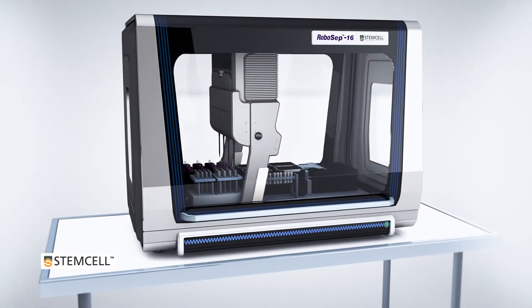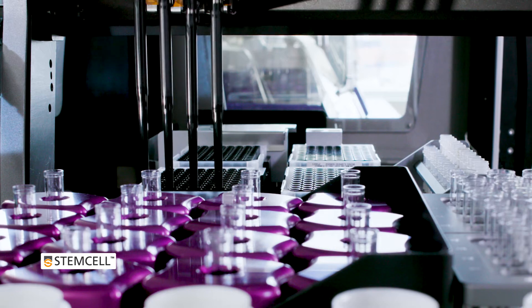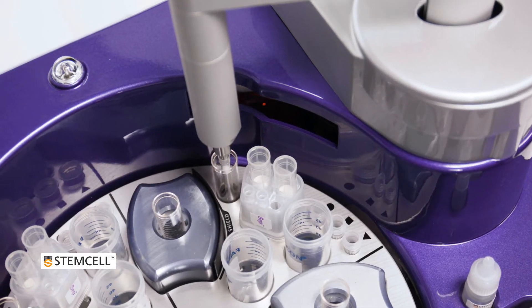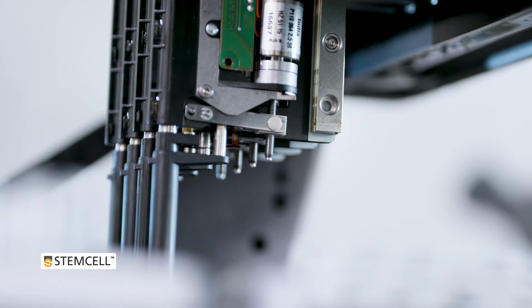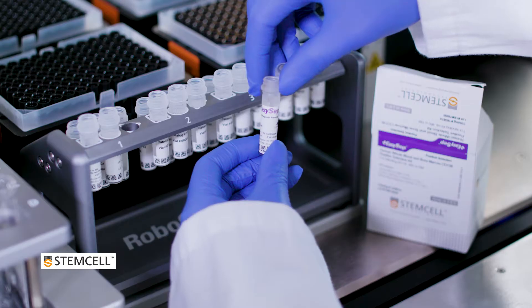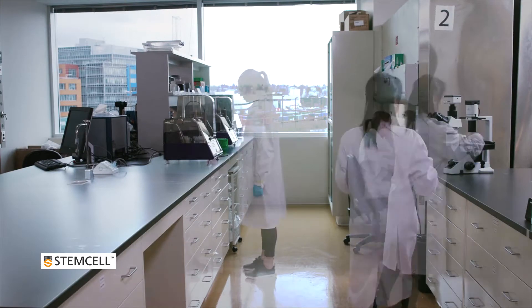RoboCEP-16 is a fully automated cell separation platform by Stem Cell Technologies that combines the ease of use and performance of the popular RoboCEP-S instrument with the increased sample throughput demanded by many busy laboratories. The RoboCEP-16 uses high-performance liquid handling robotics and a column-free isolation system using EasySep reagents to easily integrate cell isolation into your existing lab workflow.